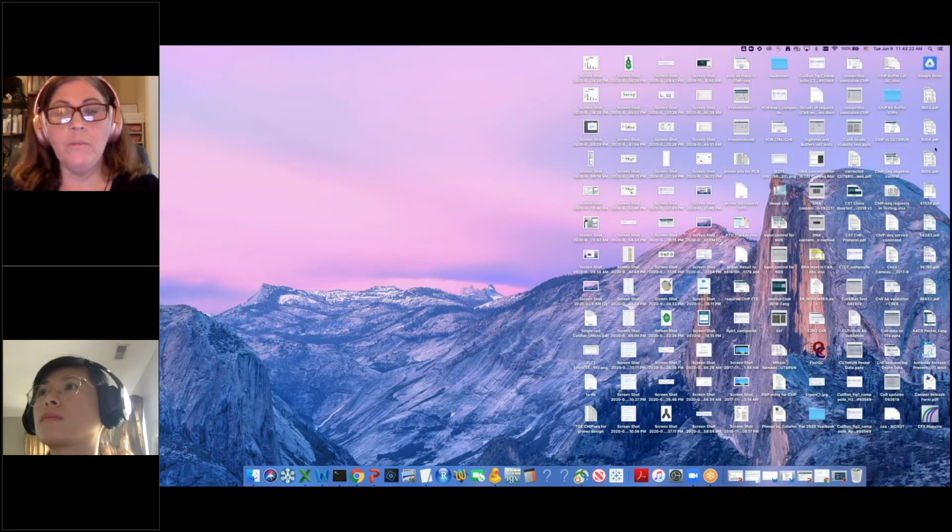I am working with a limited number of cells and looking at both histone modifications and transcription factor binding. What is the minimal number of cells I should use for my experiments? Our kit is validated for 100,000 cells per reaction. And as I showed in the last slide of my slide deck, the kit also works very well for about 10,000 cells per reaction.